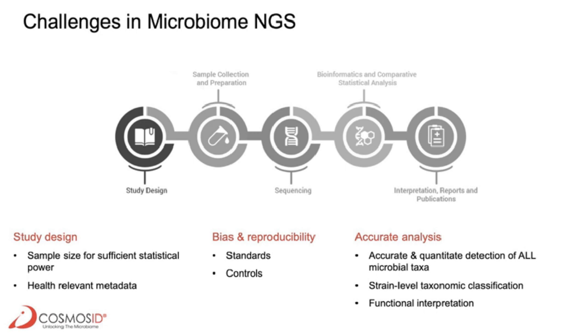For example, microbiome studies often do not have a statistically significant sample size. Sometimes that's because of the increased cost of sequencing. And to this end, the miniaturized, cost-effective method that Jefferson presented earlier today would be a perfect way to accommodate a large-scale, statistically significant sample size into microbiome studies at affordable cost.